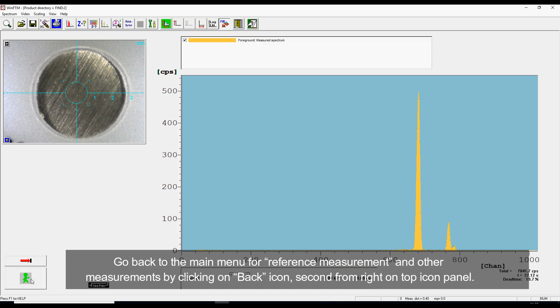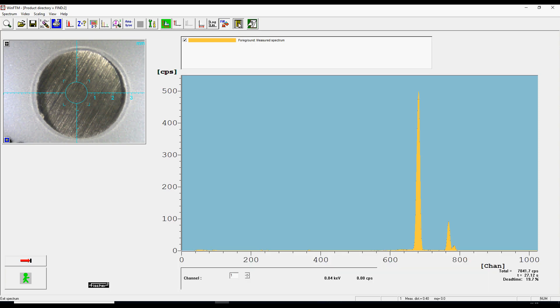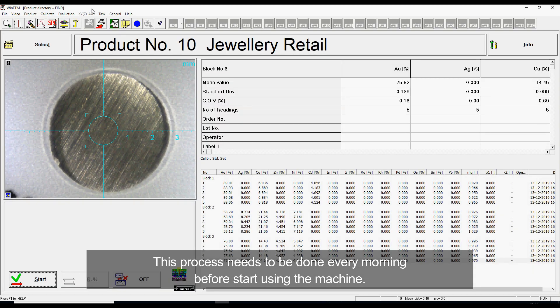Go back to the main menu for reference measurement and other measurements by clicking on the back icon, 2nd from right on the top icon panel. This process needs to be done every morning before starting to use the machine.